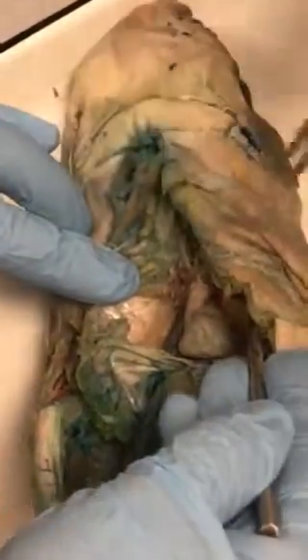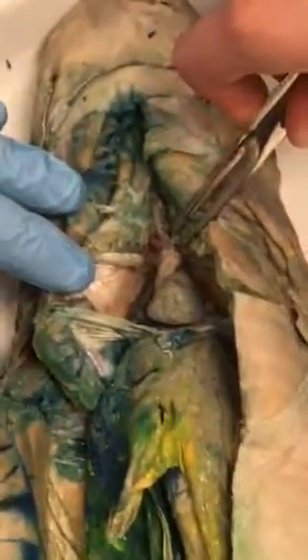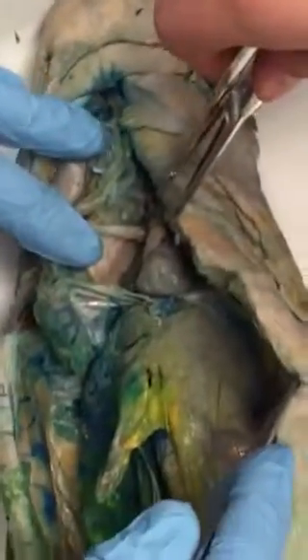And then the last one goes into and forms the ventral aorta, which is up there. The ventral aorta is on top of the conus arteriosus, which almost immediately branches off into a bunch of different things. Do we need to know any of the different things? No, it's the next one on the list here. Well, I didn't have to label them.